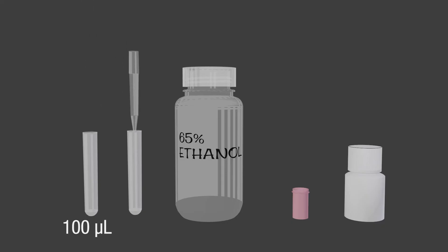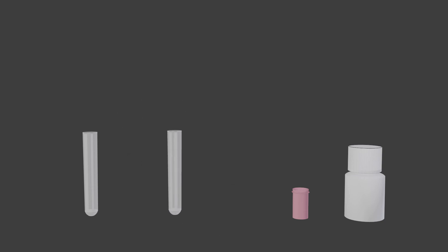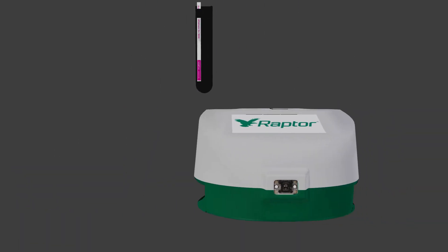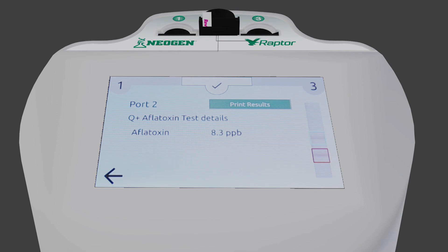Add 100 microliters of sample filtrate to a sample collection tube. Add 100 microliters of 65% ethanol and mix well. Transfer 100 microliters of the sample dilution to a red dilution cup. Add 500 microliters of sample diluent and mix well. Place Raptor cartridge into port. Add 400 microliters of sample to cartridge. Result will be displayed. Remember to multiply your result by the dilution factor. For this example, multiply by two.